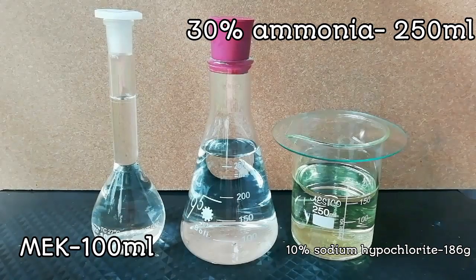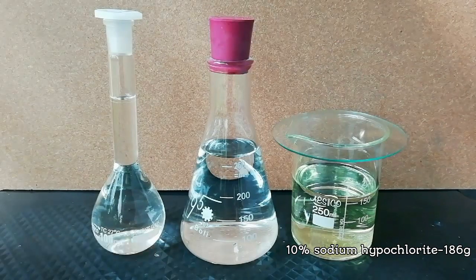For making luminol, hydrazine sulfate is used as a chemical reagent. That is why I make this video.